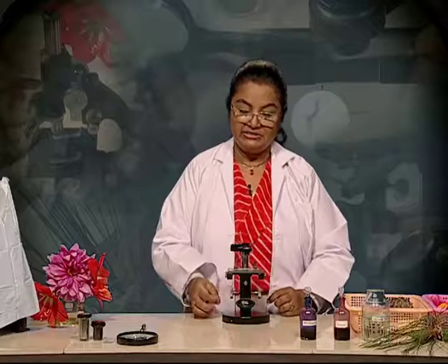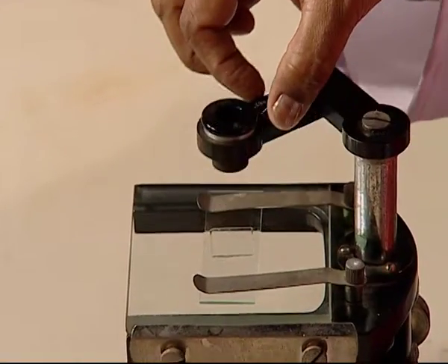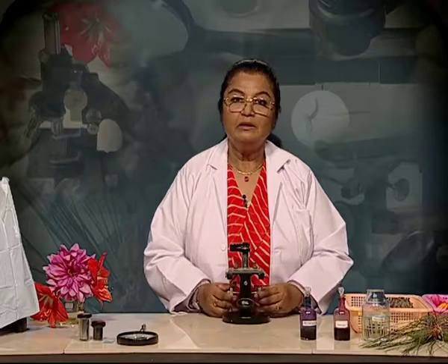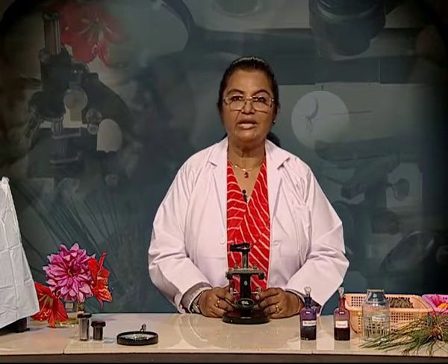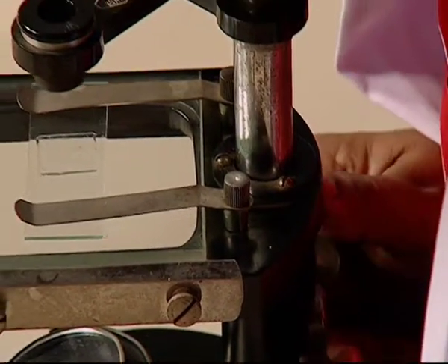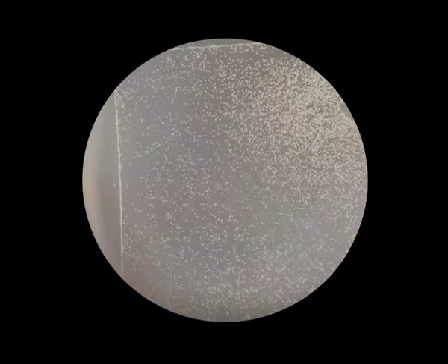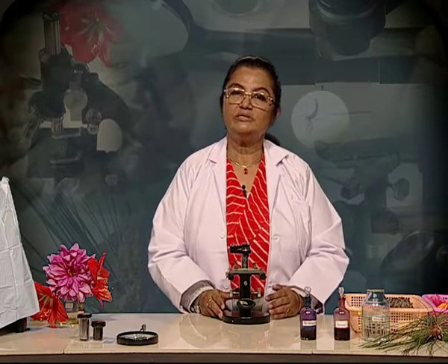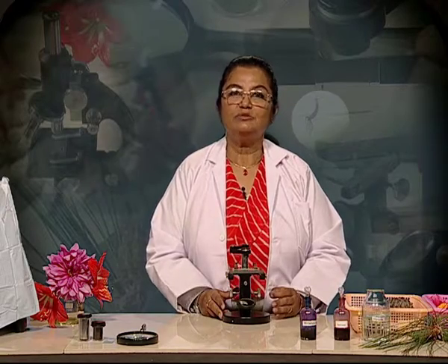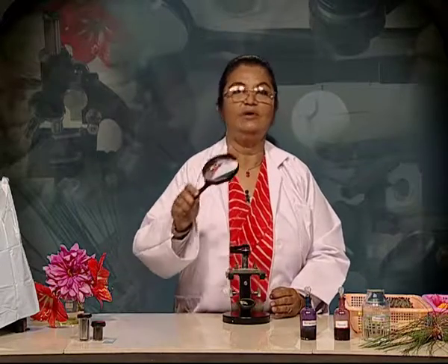We can further adjust the lens over the object with the folding arm. Now, we will rotate the adjustment knob to bring the object to clear focus. Through the dissection microscope, we can see the pollen grains are appearing much bigger and they have a certain shape which is much different from the small specks of dust that we saw with the help of hand lens.